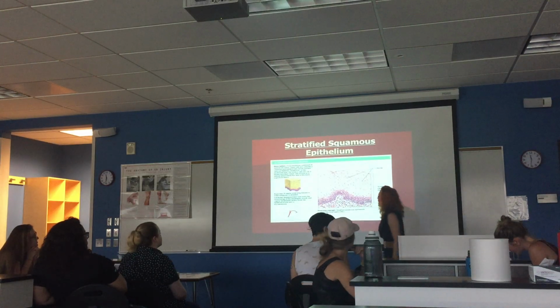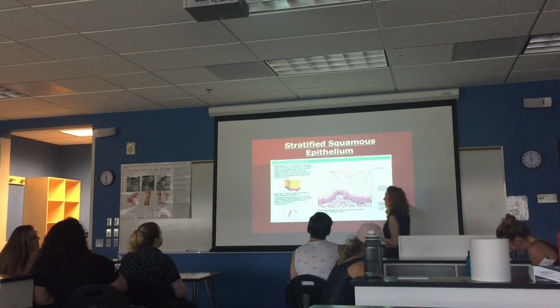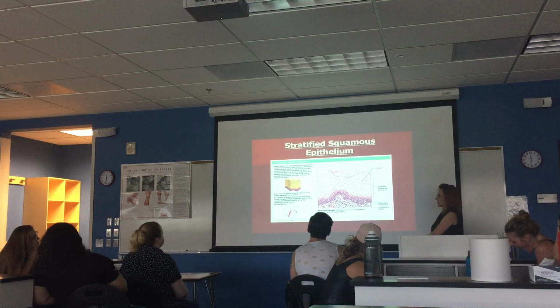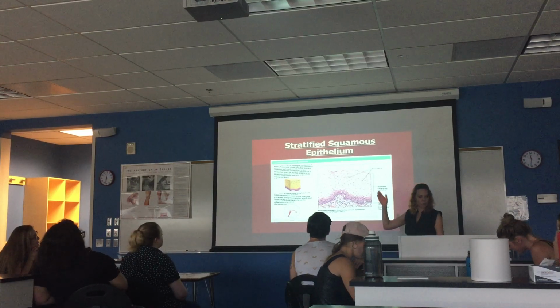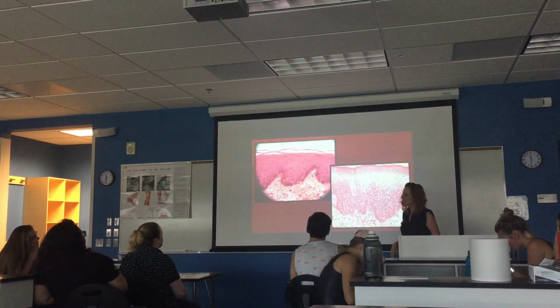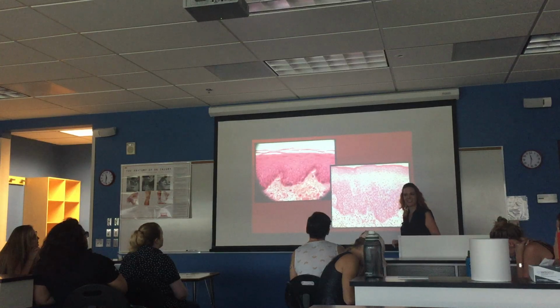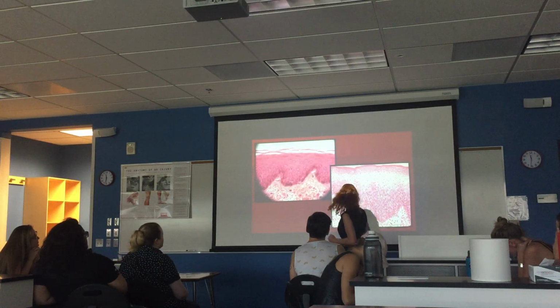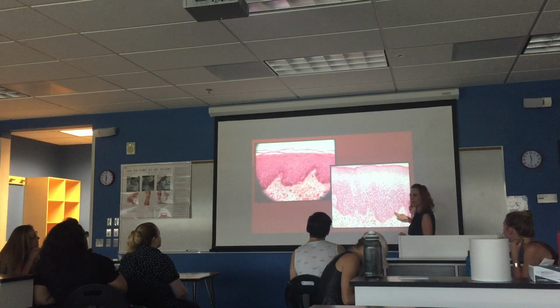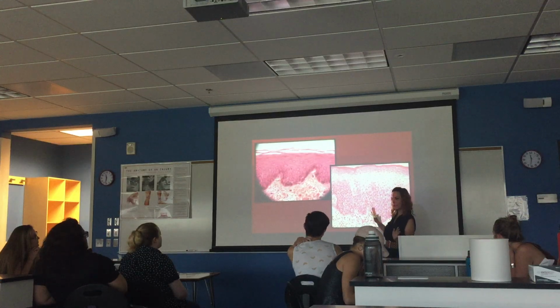Now we're in the stratified. Stratified squamous, like I said, is protection against abrasion specifically. And there's 2 different kinds, keratinized and non-keratinized. That'll be about chapter 5. And in chapter 5, we'll name the different regions of these strata. Right? This will be the stratum basale, or the basal layer, and then so forth. Okay? So, we're not worried about that yet.